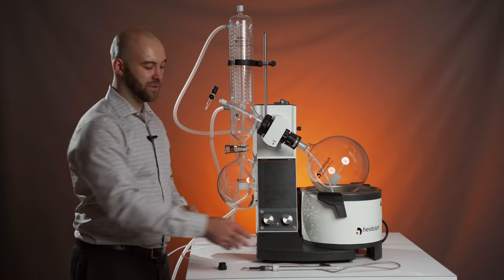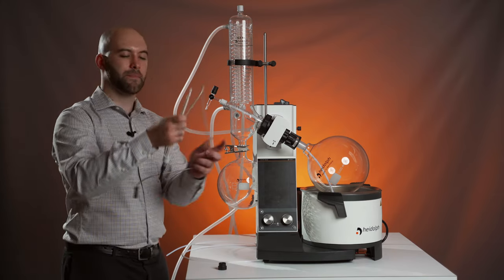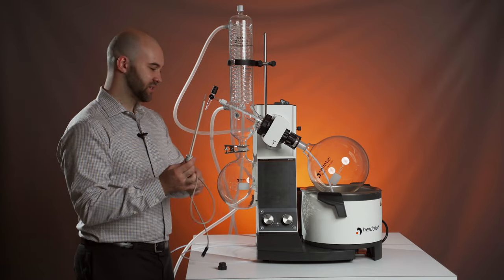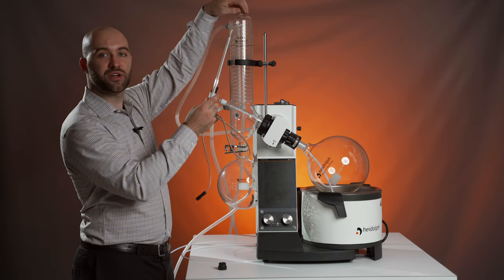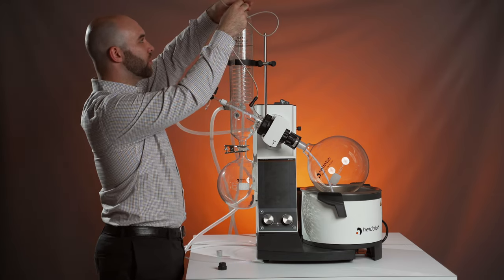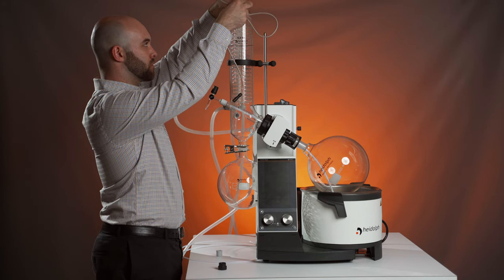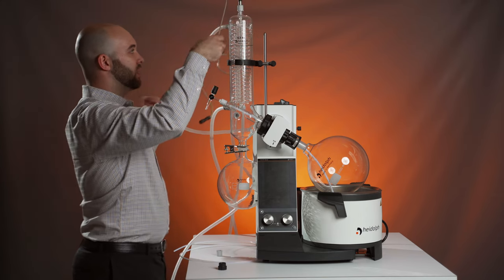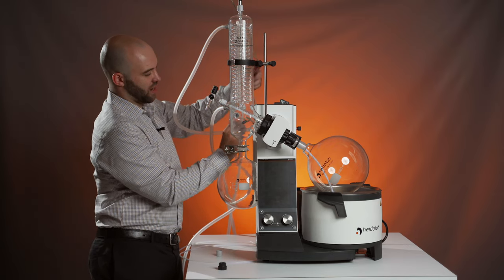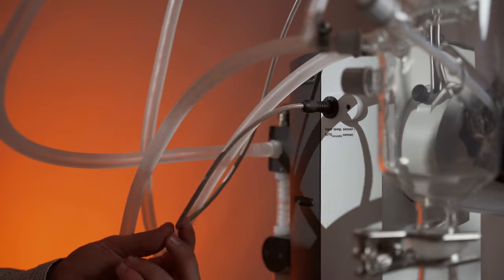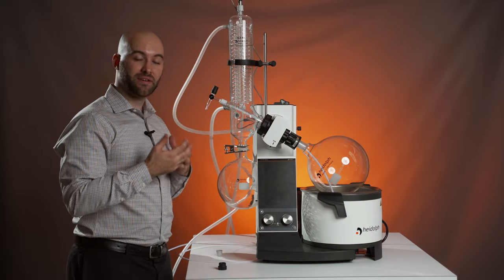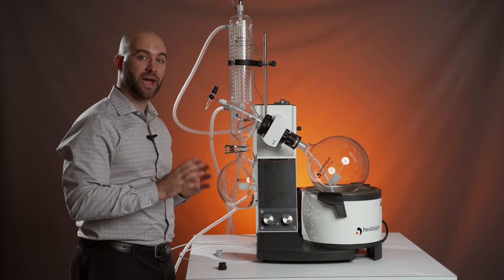The second most commonly used accessory with our HiVap is the auto accurate sensor. This sensor will replace this GL18 cap up here, slide through your coils, and plug in to the side of your HiVap drive. What this sensor enables is automatic evaporation through our dynamic auto accurate function.